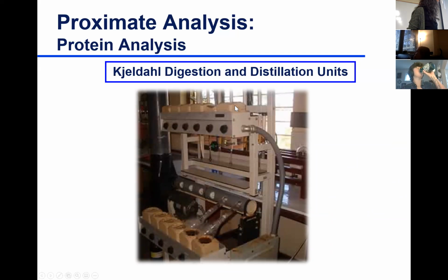On the upper side is where we do the distillation. The distillation unit is up there, you don't see it in the picture. It takes a much longer time to distill than the few minutes we distill using the instrument we have in the lab. So I spent many hours on Kjeldahl before.